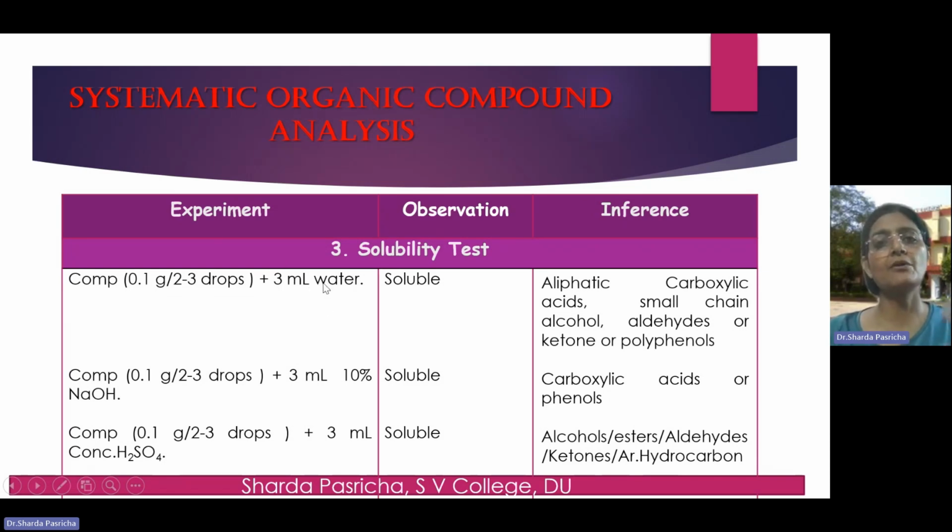Shake it. These are organic compounds, so they do not dissolve immediately. Give it some time. Shake it well and then see. If the compound goes into solution and you get a single homogeneous solution, then you say that the compound is soluble. If the solid remains at the bottom, or if you get two different layers, some oil settling at the bottom, that indicates that the compound is not soluble. Now let us go to the specific solubility tests.